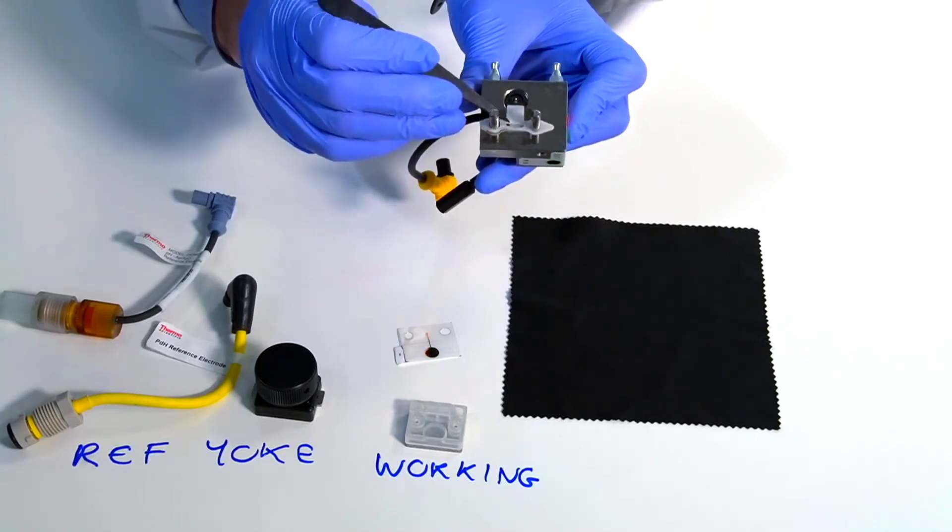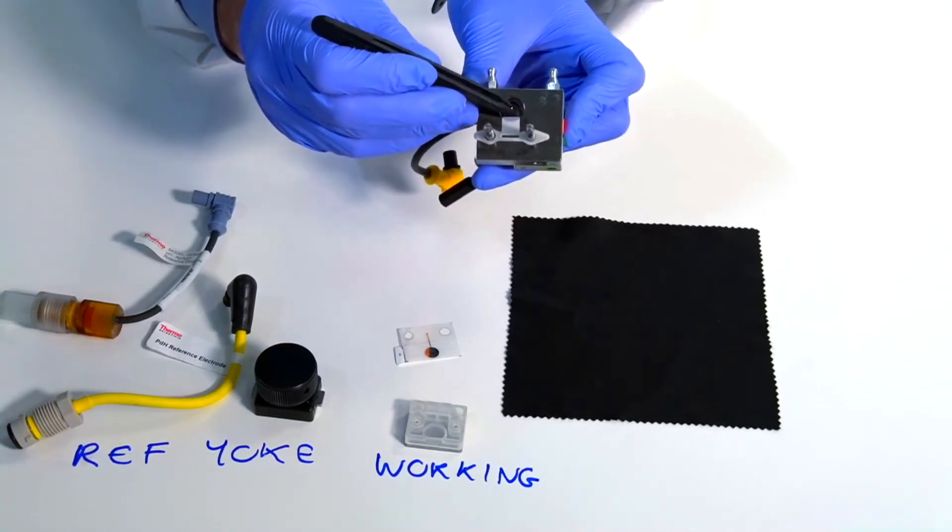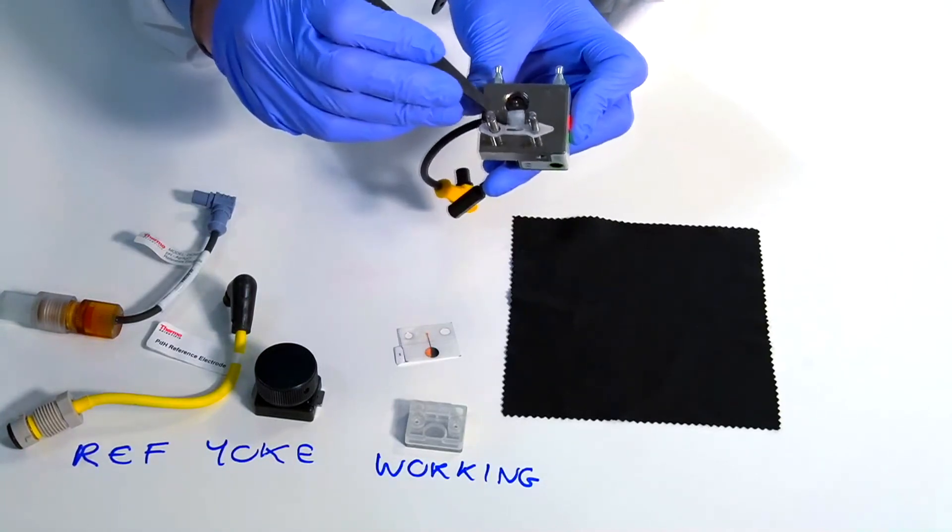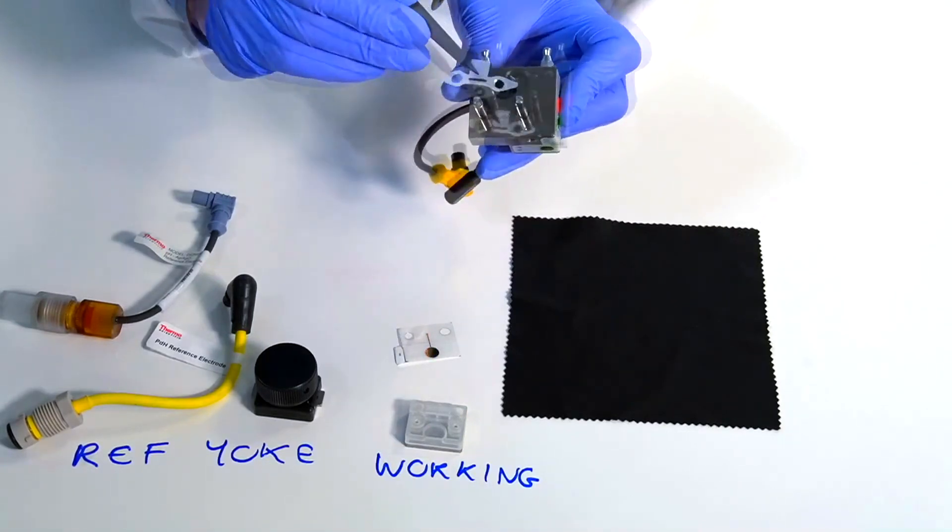It's also very important with the disposable one that this little tag is pointing between the cell and the pin because it's an insulator as well. So the orientation is important there.